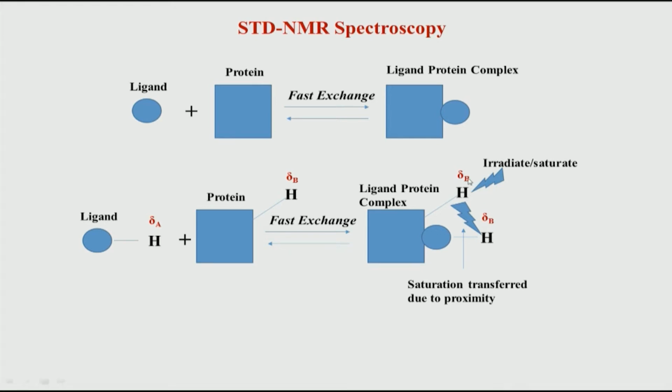Here it is a similar situation, but the hydrogen need not be close in space, because there is what is called spin diffusion. That is also a terminology and concept we discussed in NOESY. We said that spin diffusion happens when there is no direct transfer, but an indirect transfer of magnetization, or polarization, from one hydrogen to the next neighboring one, and so on. It is kind of a relay, and for that relay process we also use the word spin diffusion.